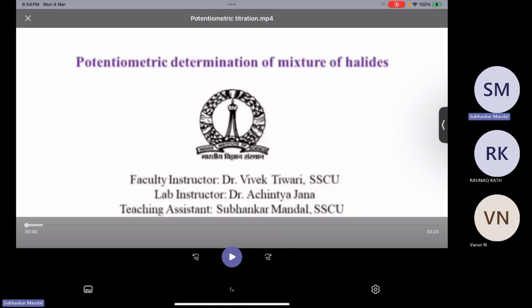We can increase the speed so that we can quickly discuss, because this is a 30-minute video. I think no need to see quickly. I can tell what we are doing. So this is the potentiometric determination of a mixture of halides. Basically we have given three halides, chloride, bromide and iodide solution, and from there we calculate how much concentration of iodide, bromide and chloride was there, from the potentiometric titration.